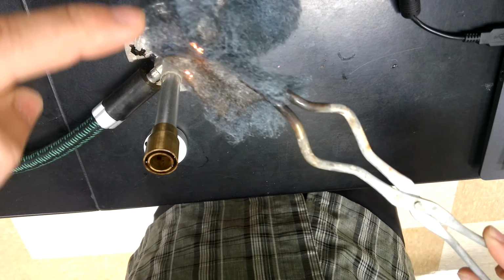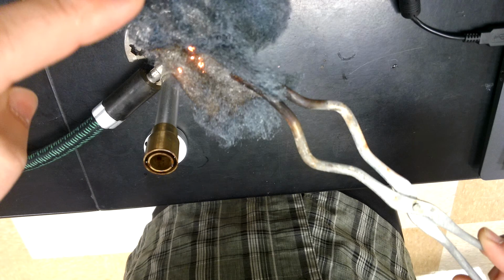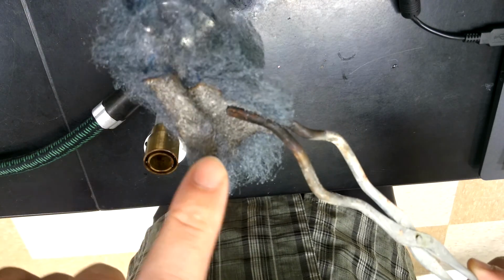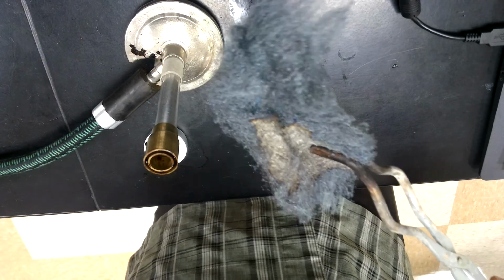Put it out. The cool thing with the steel wool here, now that we're out of fire mode, is that it's still going, and it's changing color. You got a new color. It actually looks different. Kind of hard to see on camera, I know. But there's a difference between where that isn't burnt and where it is. It gave off a lot of heat and light. So there's your evidence for the steel wool.